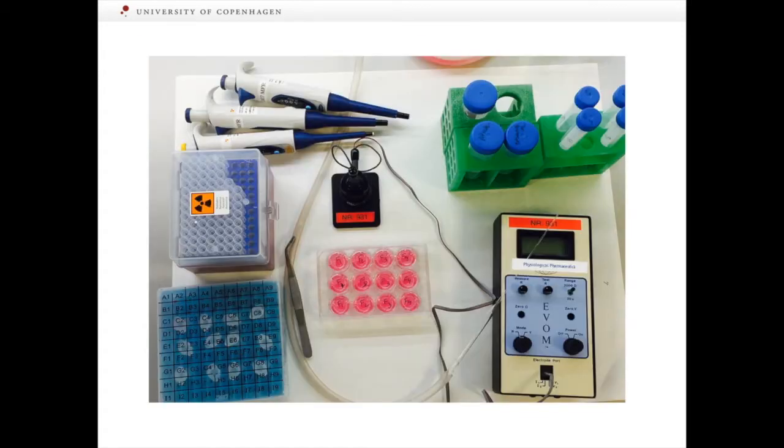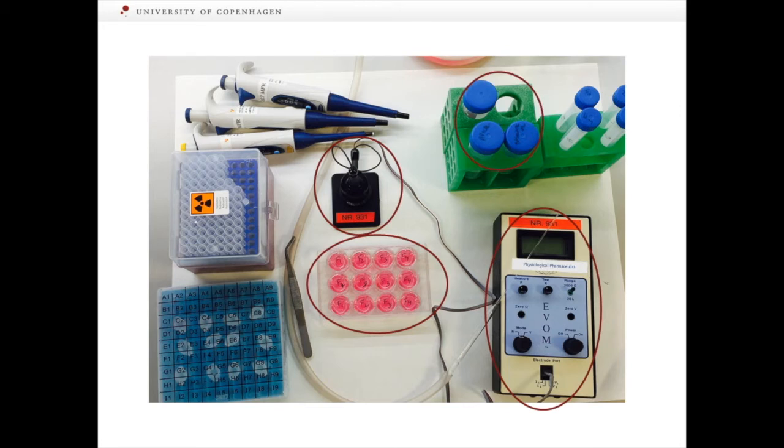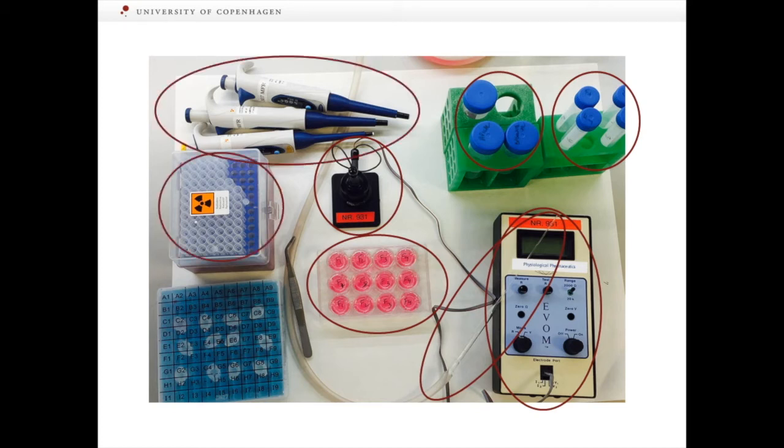For the following demonstration, the depicted equipment will be used. Most importantly, the Caco-2 cells seeded about 21 days earlier, a portable voltmeter for TEER measurements, transport buffer both for washing the cells before and after the experiment, transport buffer with the compound or formulation of interest for addition to the apical side, a Pasteur pipette attached to a pump for easy removal of media when washing the cells, pipettes and pipette tips both for the addition of exact basolateral and apical volumes as well as for sample removal, labeled sample tubes for each well and time point, and lastly tweezers for handling the transwell when measuring TEER values. With that sorted out, we're now ready to conduct the experiment.